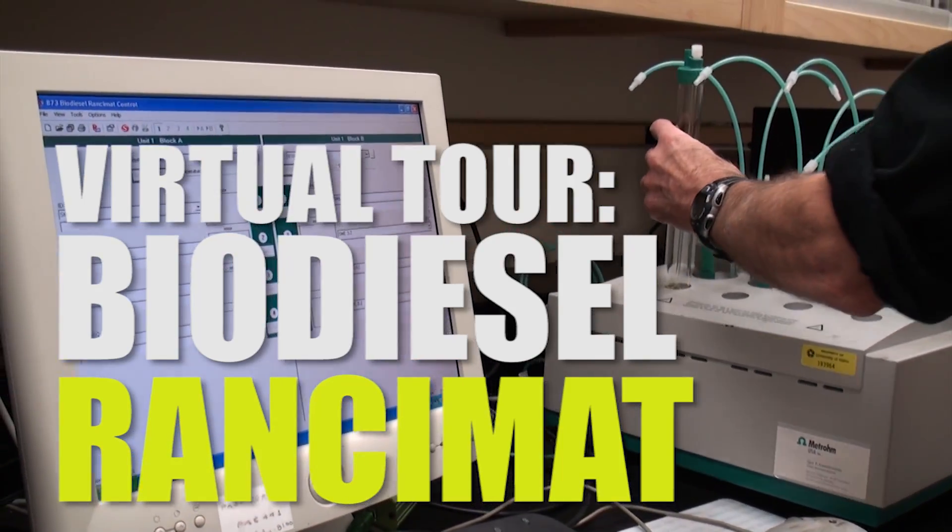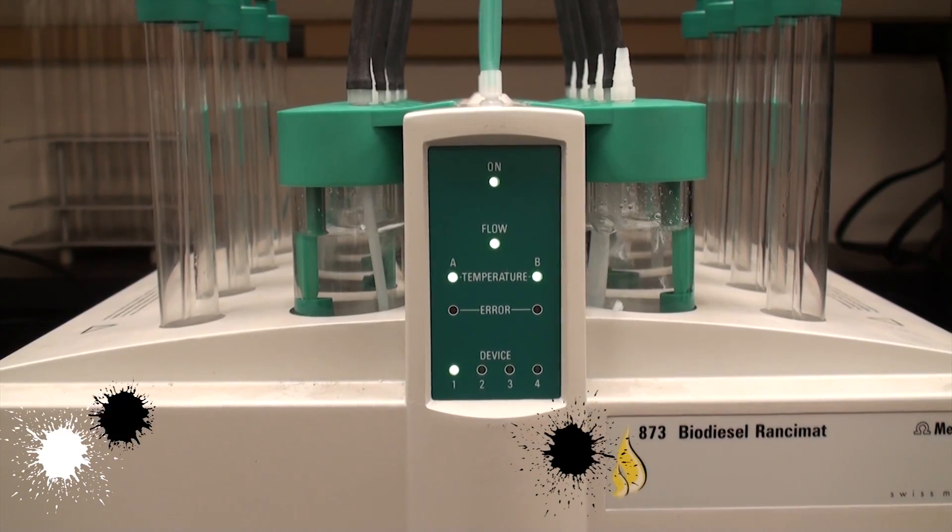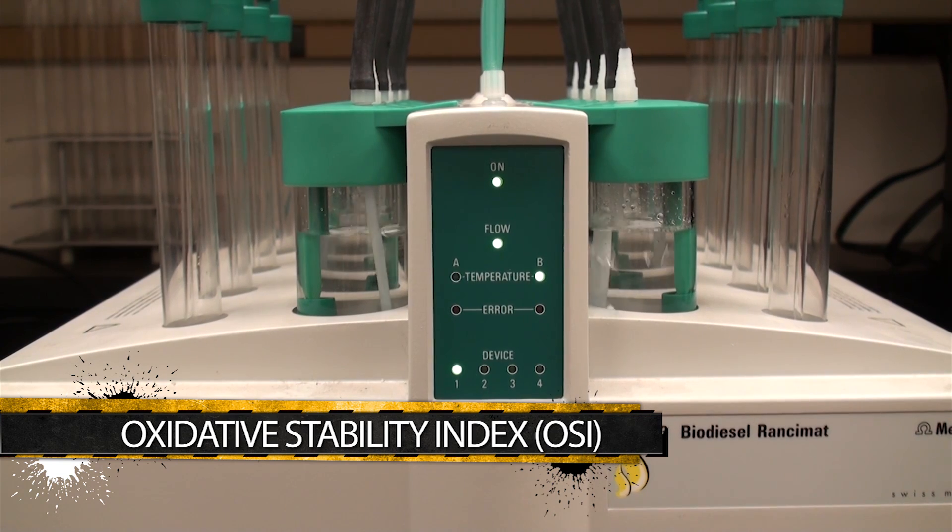I'm Joe Thompson with the Bio and Ag Engineering Department. This is our biodiesel rancimat made by Metrom, an instrument that we use to measure the oxidative stability index of biodiesel samples.